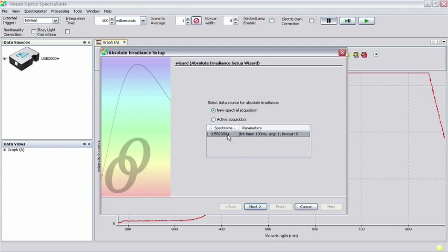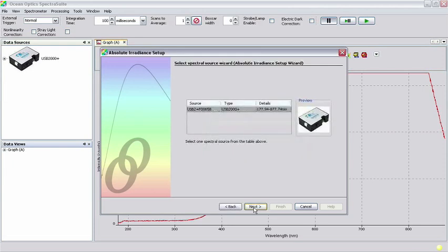Select New Spectral Acquisition and click Next. Make sure that your spectrometer is highlighted, indicating that this is the source of spectral data, and click Next.